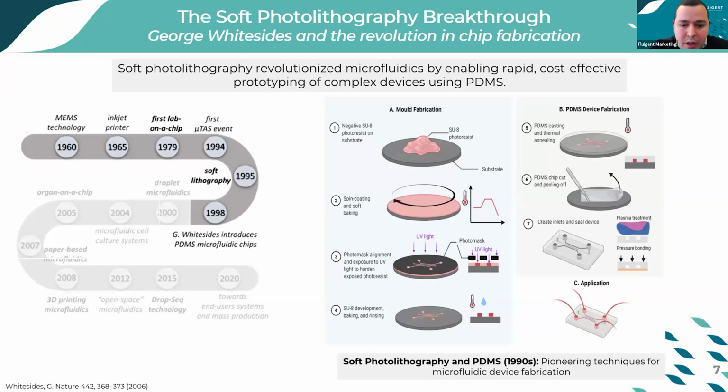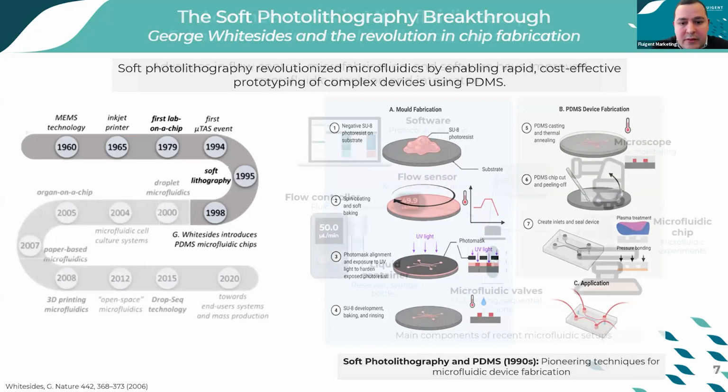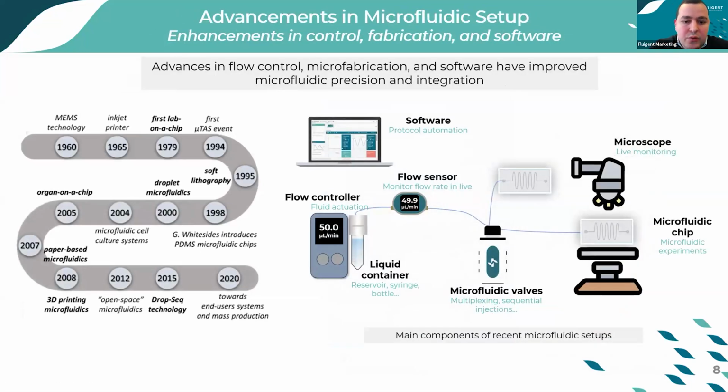So since then, microfluidics has come a long way, and we moved from simple syringe-driven systems to advanced setups with pressure controllers, flow simulation, a wider range of materials, 3D printing, and automated flow software. This evolution has unlocked greater control, flexibility, and application possibilities across science, medicine, and healthcare.